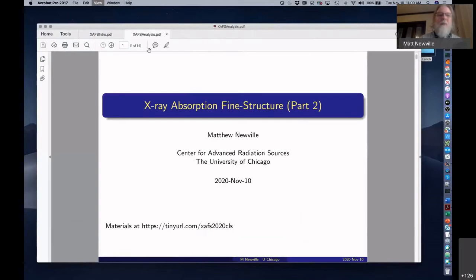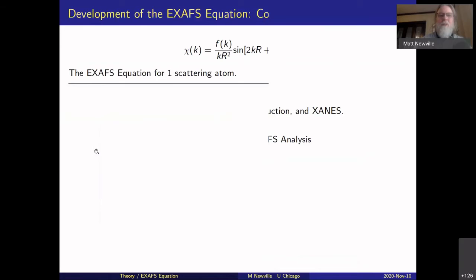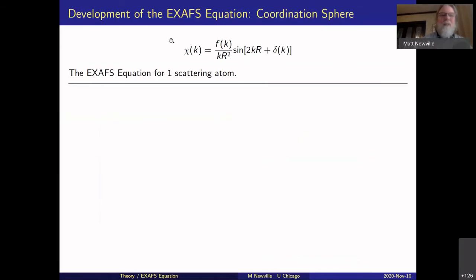We went through the basics of X-ray absorption and a bunch on the XANES analysis, a little bit about using the software in general. So we're going to continue and do the extended XAS in more detail. And we're going to go for as long as we can stand it.